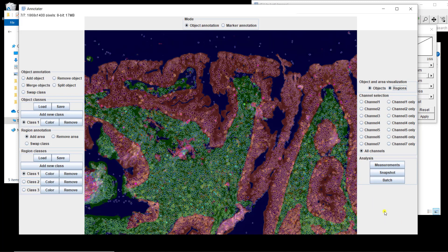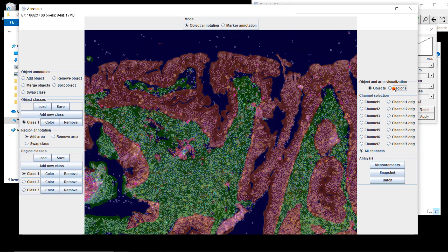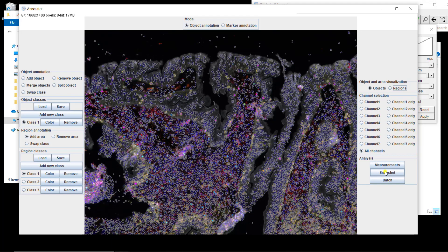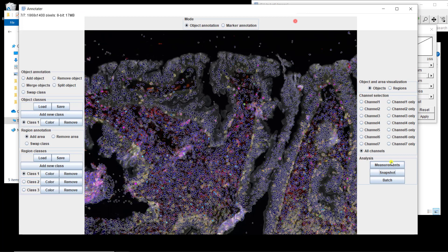Here we have a few things we can do. First, we can do a snapshot, which will be your image with the nuclei segmentation and regions overlaid on top. This can be useful if you want to show your results in a presentation or a figure. You can also remove the regions and only have the nuclei segmentation. We can also do measurements.